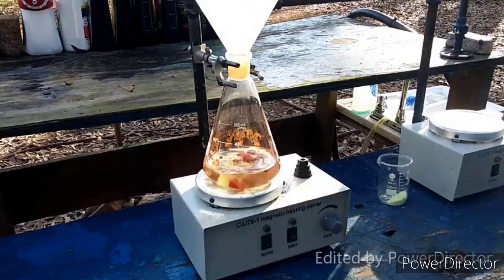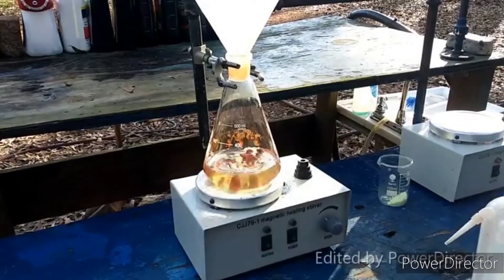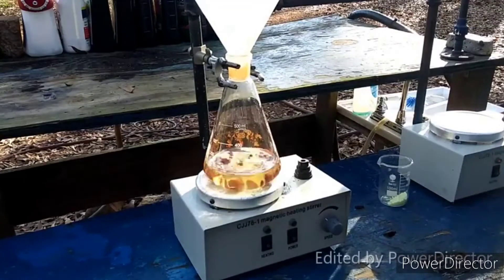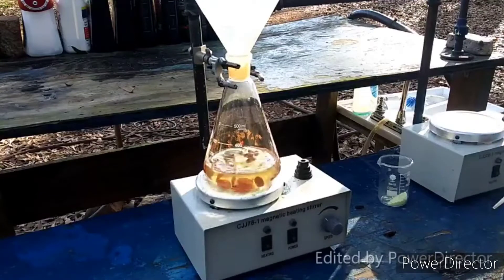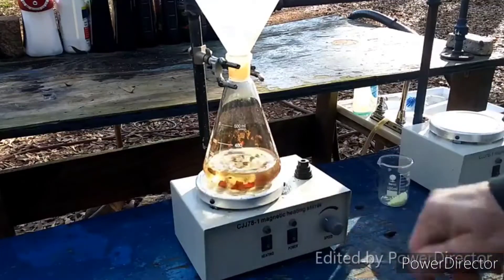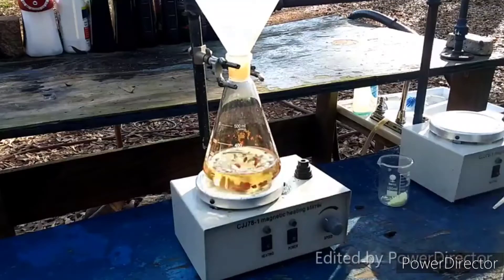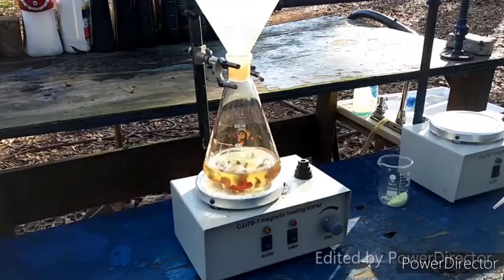That went a lot quicker than I thought it was going to. Kick ass. Since we have to reflux it anyway, the heat's already on, and I'm just going to let this stir until all of the antimony trisulfide has dissolved, and then I will add in the sulfur and set up a reflux. I'll come back then.